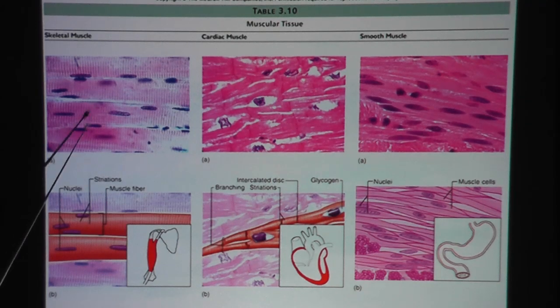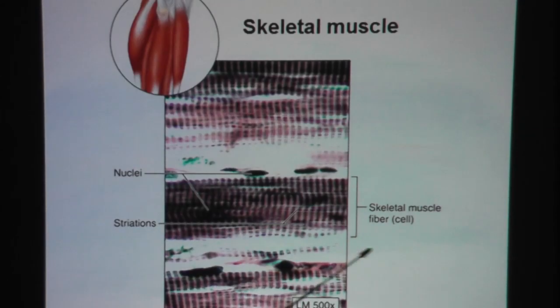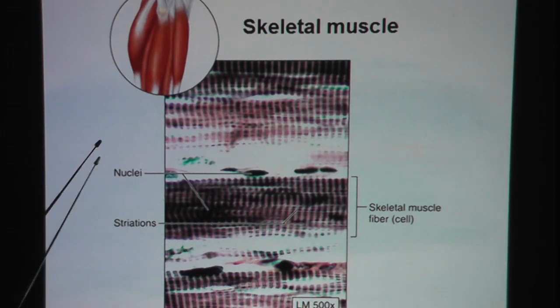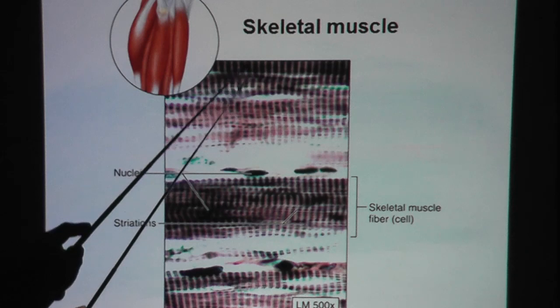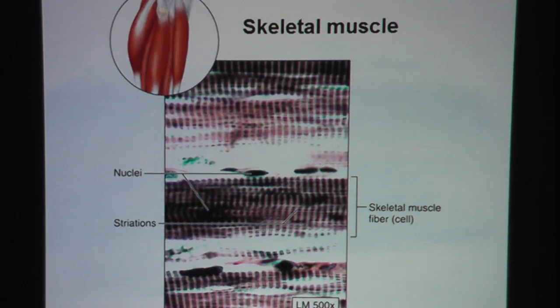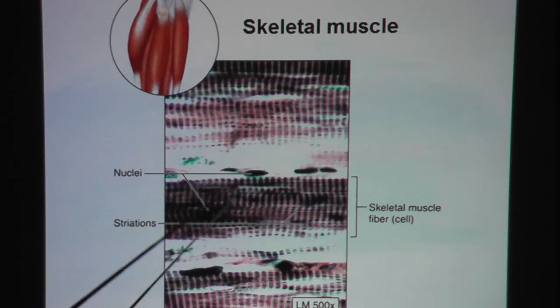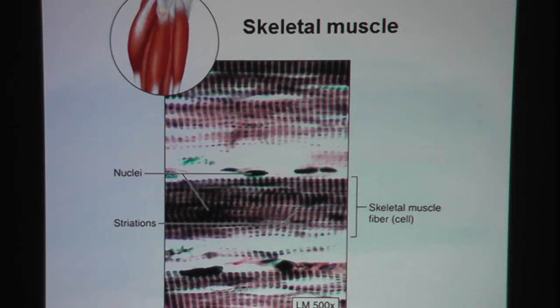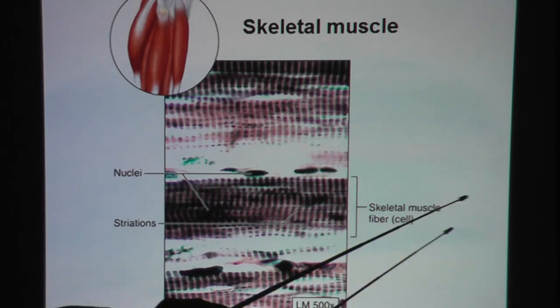On high power, as you can see, skeletal muscle has its unique stripes — very obvious. These stripes are called striations and they run parallel to each other. They also run perpendicular to the whole length of the muscle fiber.